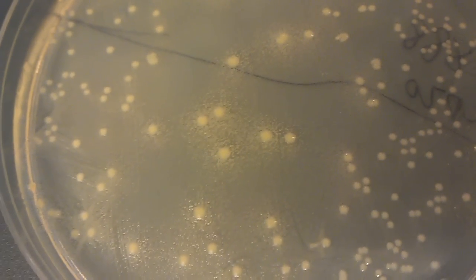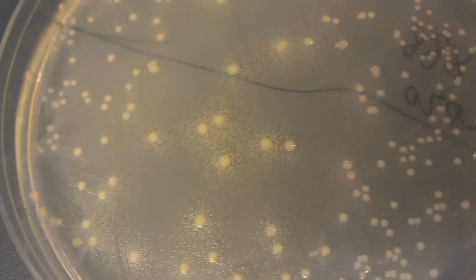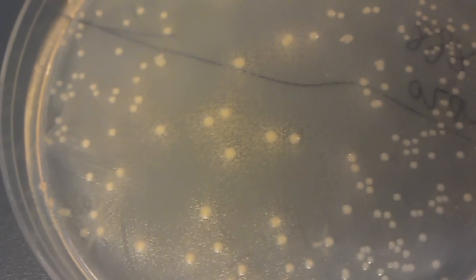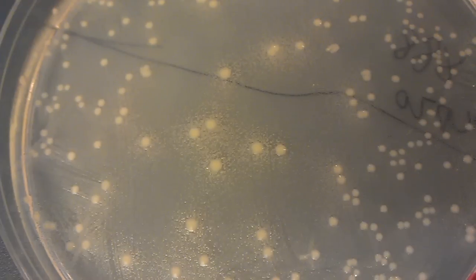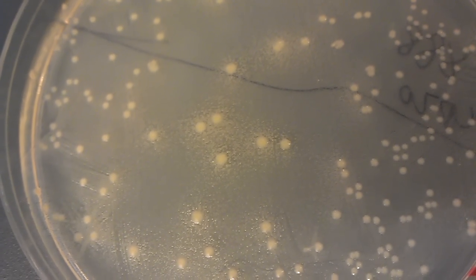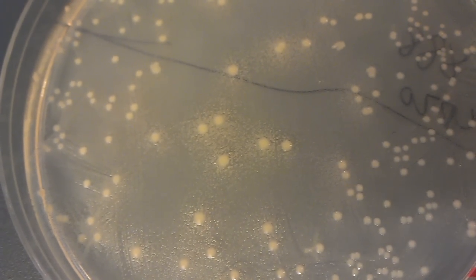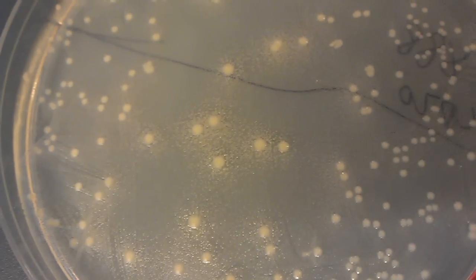So you need to be very careful when you pour ampicillin plates and when you're plating anything and you're using ampicillin for your selections. If you have any questions about satellite colonies, let me know, but for now, try to avoid them. If you don't want satellite colonies, there's some other really good antibiotics out there like chloramphenicol and kanamycin. We occasionally get spec satellite colonies, but I don't know what's going on with that. I think that's just a contamination issue. Probably shouldn't be broadcasting that, but oh well.